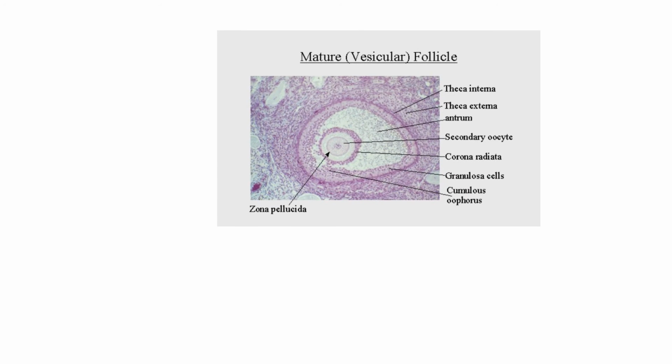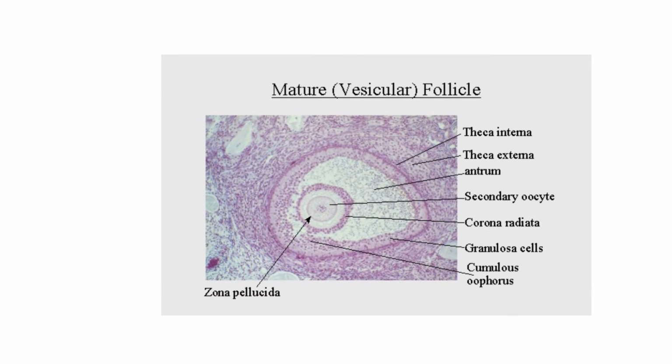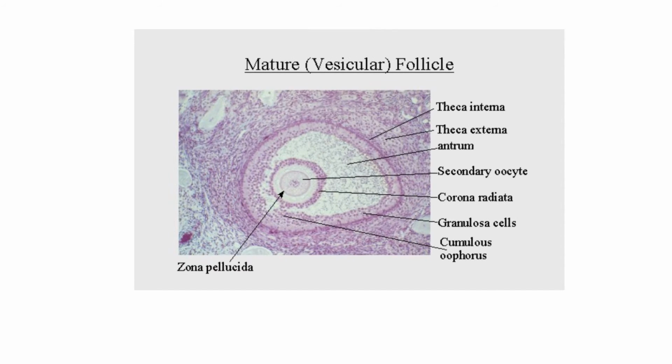It's splitting hairs, though. Of course, you know I like to look at multiple images because the more you look at, the more you learn. And I picked this one out because they're calling this antral follicle a vesicular follicle. And I think when they say vesicular, that means there is this fluid-filled antrum.